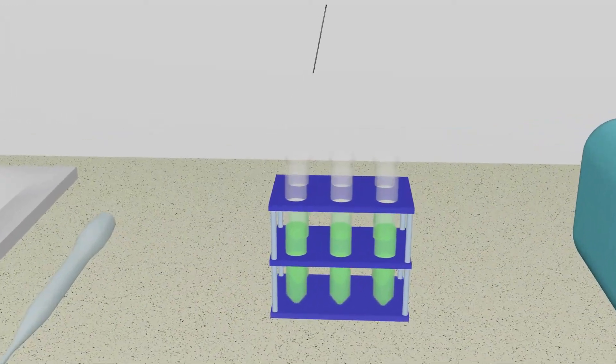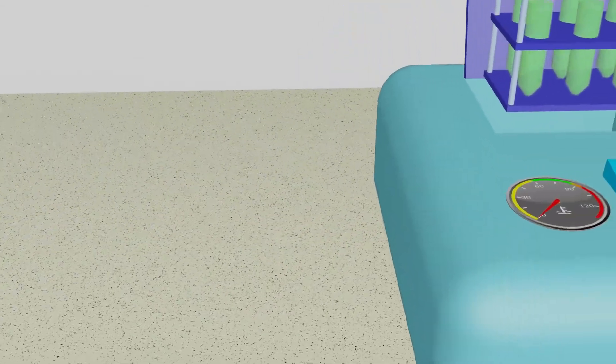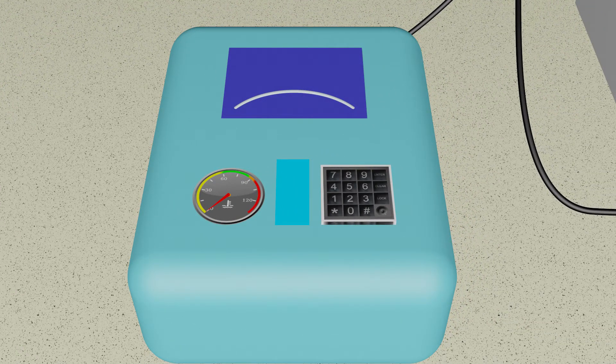The strand of hair is placed into a test tube that is placed into the PCR machine. A polymerase chain reaction, or PCR for short, is a technique that works like a molecular copy machine.